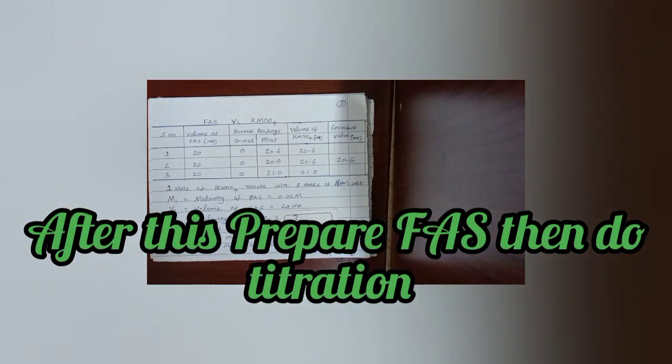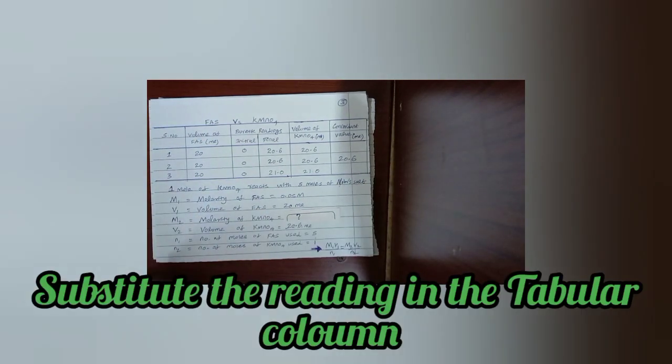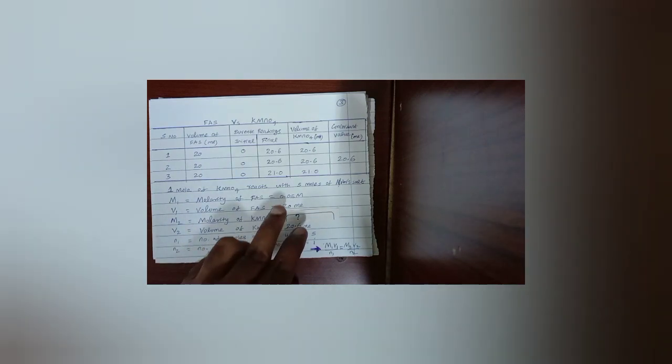Put the answer in the box. Then tabular column with the title. After writing the tabular column, check that the unit is written. Then all the formulas for M1, V1, M2, V2, N1, N2. What values you know, you can write them. Which you don't know, put a question mark.